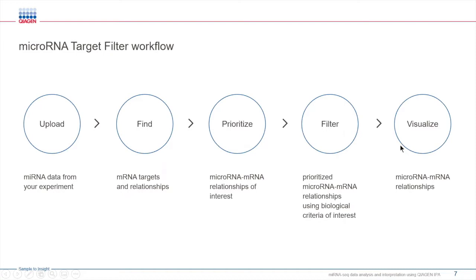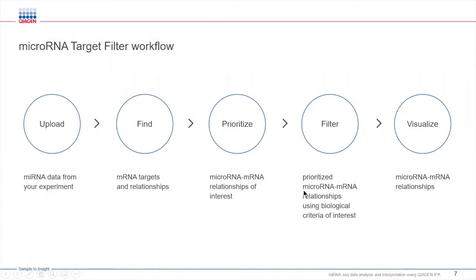Today, you will see how you can easily upload your microRNA dataset and identify mRNA targets. You can then prioritize microRNA-mRNA pairs that are most relevant to your study and filter based on biological content such as a particular disease like cancer or specific types of molecules like enzymes or receptors.